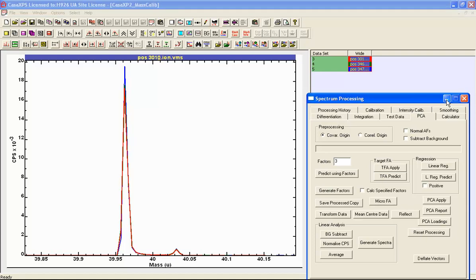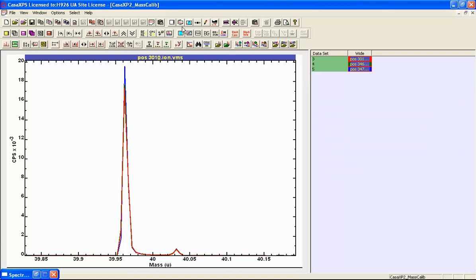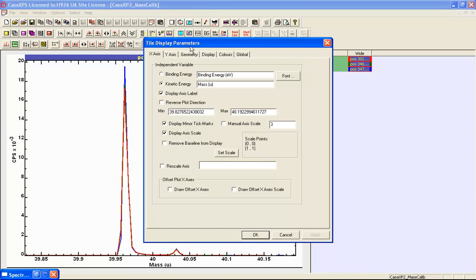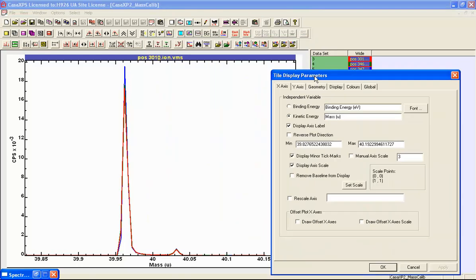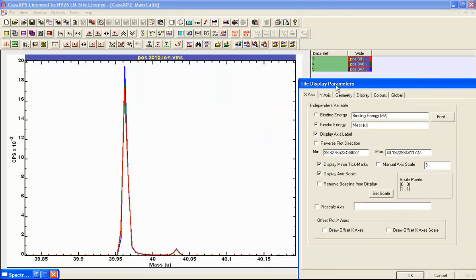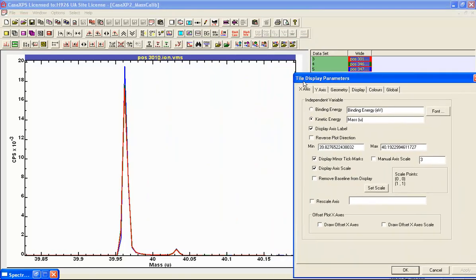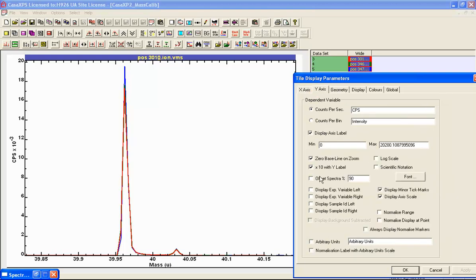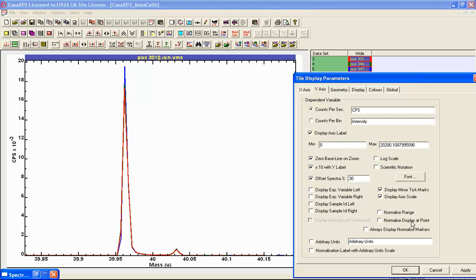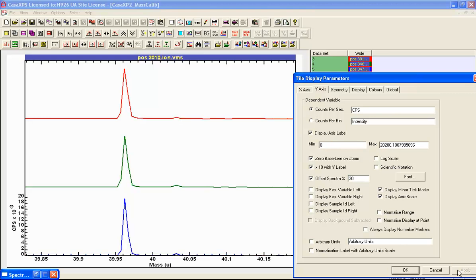The second thing that will be useful is to rearrange the display. What I'm going to use are options on the tile display parameters dialog window and we'll go with the Y axis first. What I want to do is offset the data, and offset the data using rather than 90% of the display tile, I'm going to use 30% for each one of the spectra. So if I press the apply button, I now see the spectra are offset.